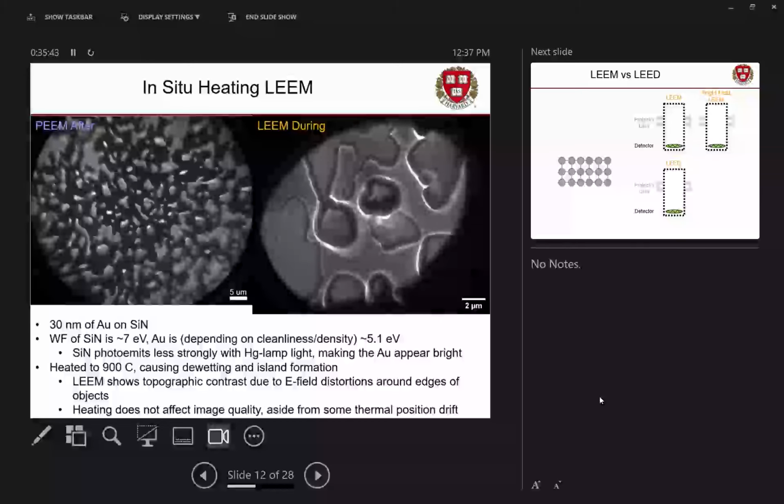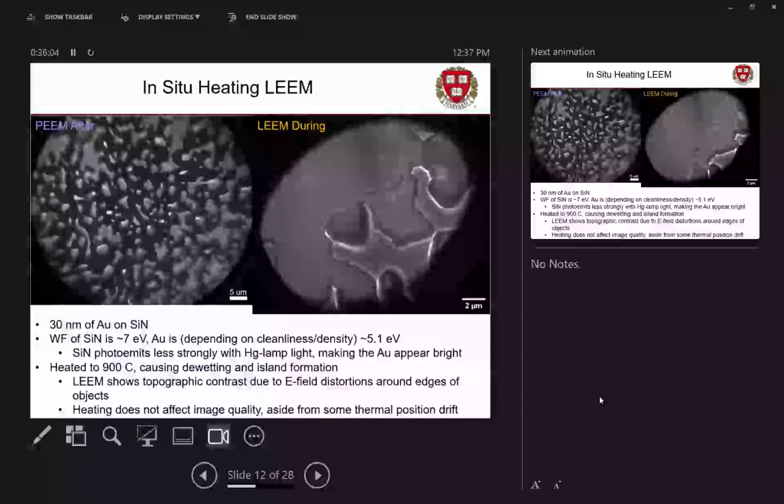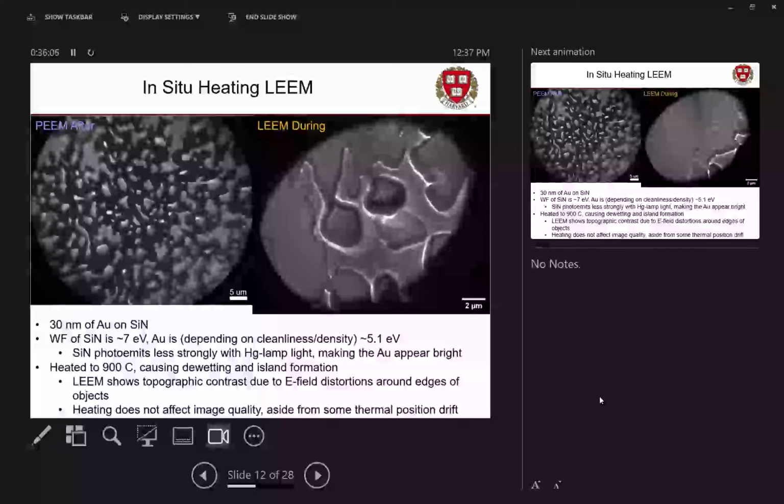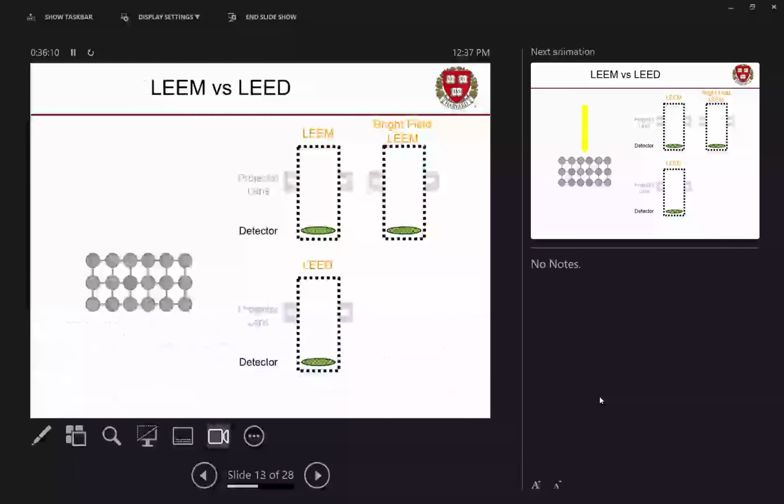And you'll notice the image quality is absolutely fine. You can see little dendritic structures on the surface where the gold is kind of being channeled away. These are the high points. You've got these weird light shadows around them. They're sticking up out of the surface now and distorting the electric field lines, so you get funny business with the reflected electron beam. But I would say it's fairly neat to be able to watch in real time a surface phenomenon like de-wetting. Anyway, I think so, but I'm a materials scientist. Okay, cool. So that's something you can do.